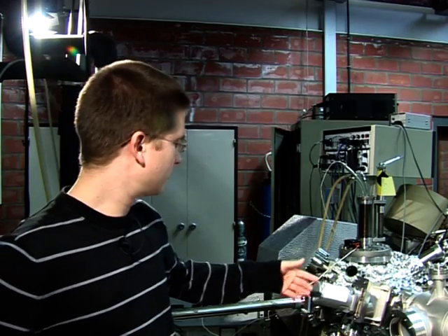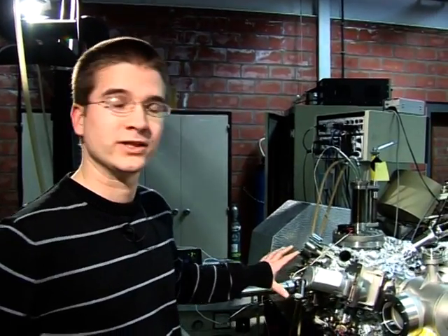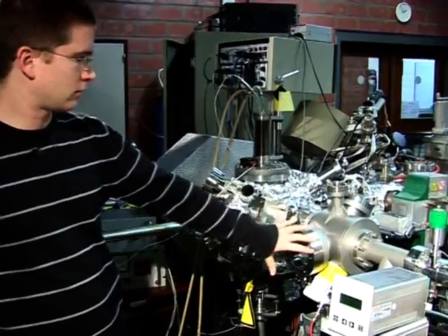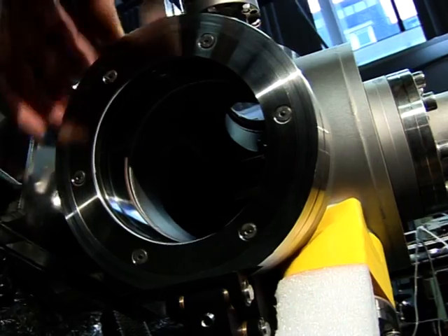So this is the new chamber I built for the project. It is actually designed to evaporate metals. So actually you have two chambers. You have a first one here — this is the introduction chamber. So you can put the sample here.